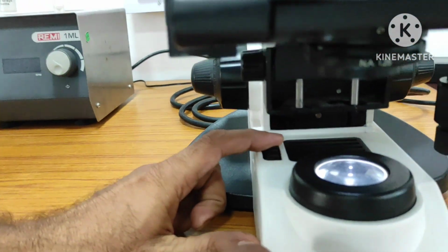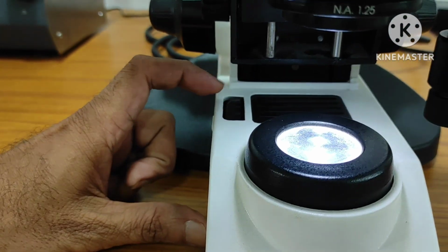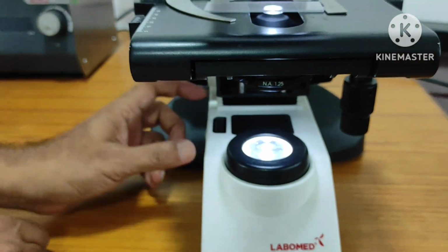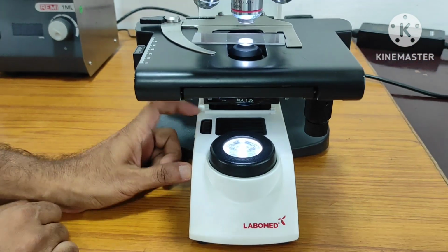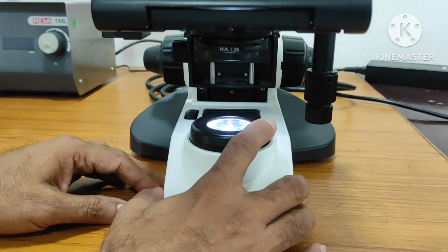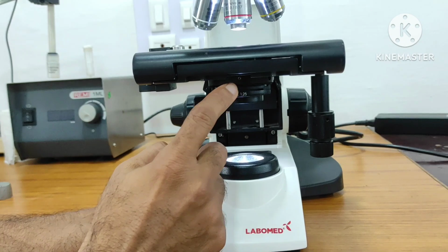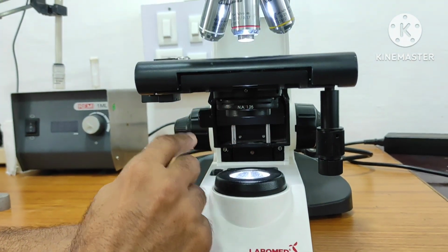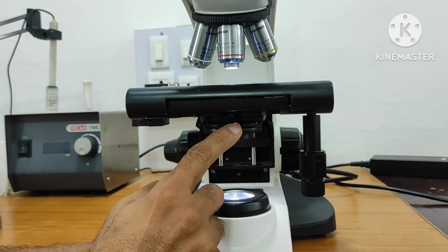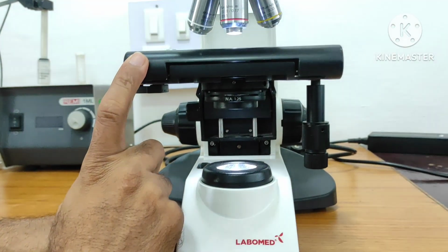And this also we can adjust, one adjustment knob is there, right? How much light is needed based on our requirement and based on our specimen, what specimen we are observing under the microscope. So this is LED light, source of the light, and you can see here this is here again a highly sophisticated adjustable condenser, right? And we can control how much light is needed, right? Some extra facilities are present here, right? Stage is also very sophisticated, right?